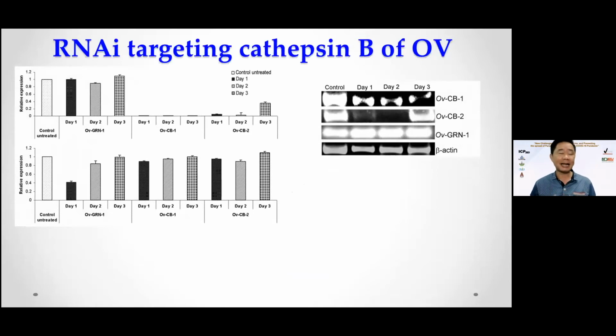We used that approach. We constructed the double-stranded RNA, introduced it by electroporation, and then checked RNA expression. The first experiment we did was a very easy one, because at that time we were very young, we didn't know much, and we didn't have much material to do the RNAi, not so expert.